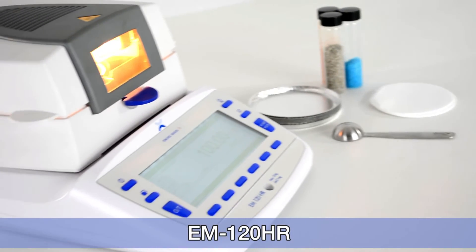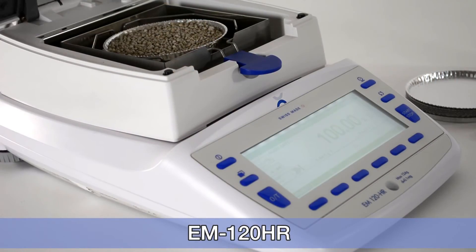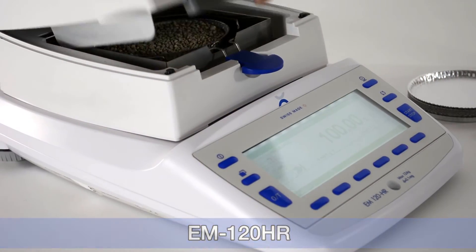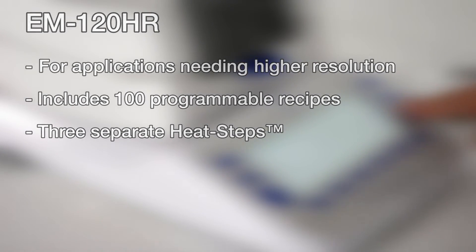The EM120HR provides higher resolution with a greater feature set, including 100 programmable recipes, each supporting three separate heat steps.